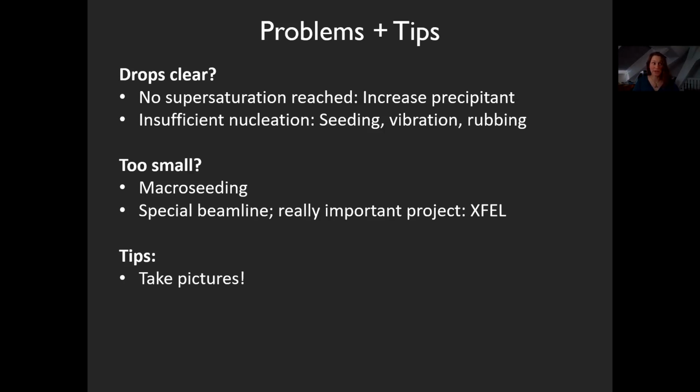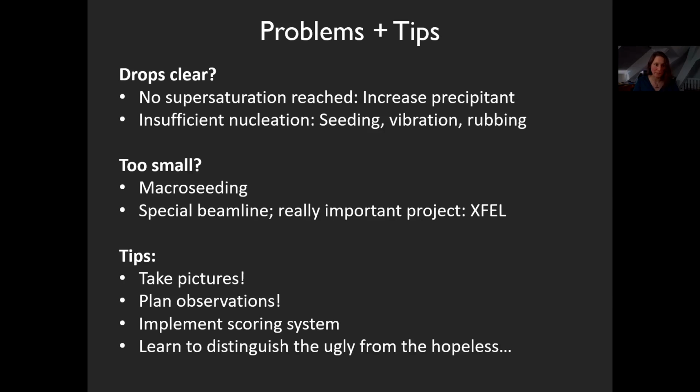Tips: take pictures of your crystals a lot. Not only do they look very nice in any publication, they also help you to document what has happened and to prove to your supervisor that yes, your protein crystal was beautiful before it dissolved again. Plan your observations, do them on a regular interval, implement a scoring system if you must, but better yet, don't pipette so many plates. Learn to distinguish the ugly from the hopeless. This comes only with experience, but after having put 40 of your hopeless crystals onto the diffractometer, you may get an inkling that that is a lost cause.